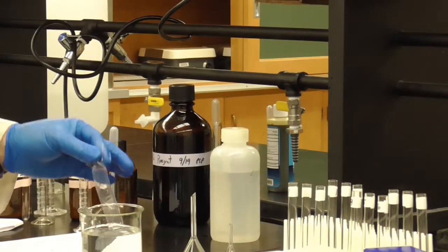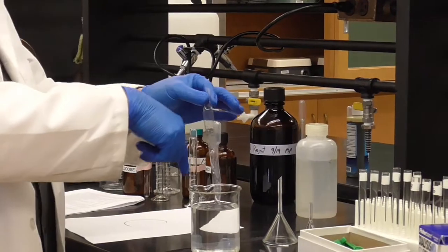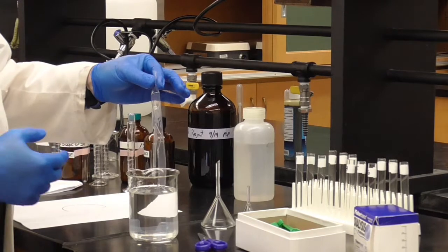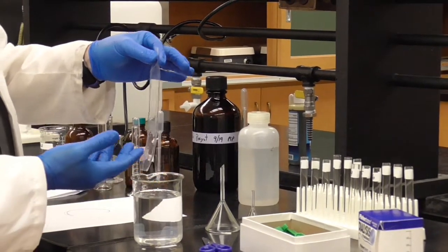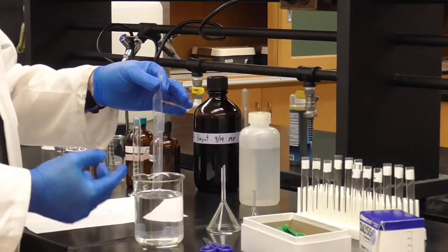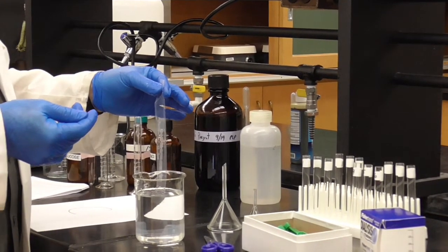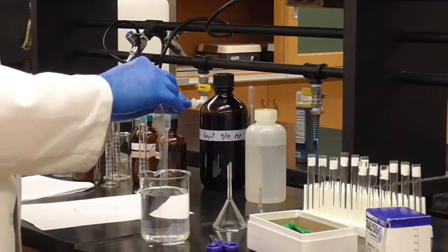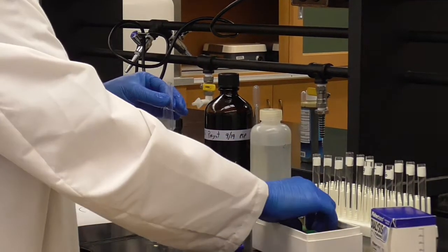All right, so we have dialysis tubing ready to go. We're going to put our solution in there and then see if we can detect the molecules passing through this, just like what you might see in an actual cell. I'm wearing gloves because if I can look at this with a microscope, it's more like a net, like I said, with little holes. And if I'm rough with it, if I use something that is going to scratch it, it might punch holes in it, or ones that I can't even see, but still bigger than I want to have. And so wear gloves to protect the dialysis tubing.